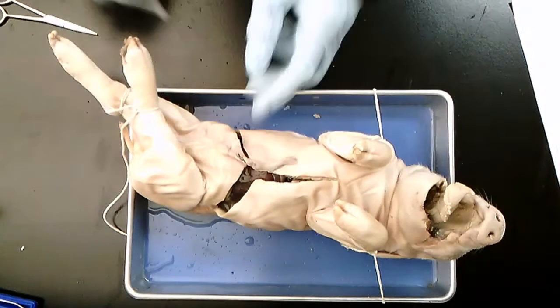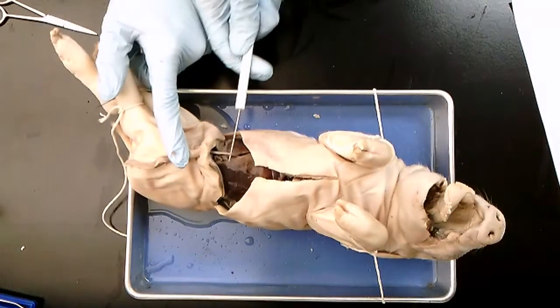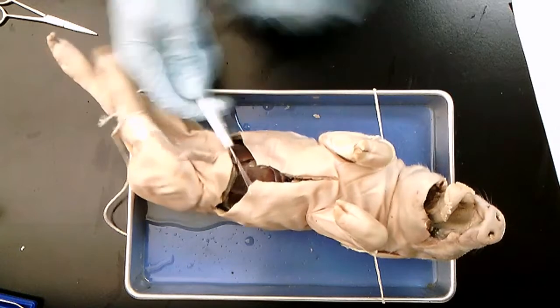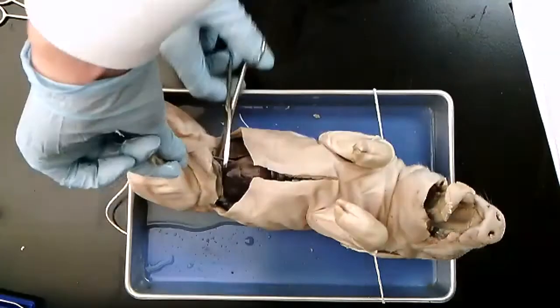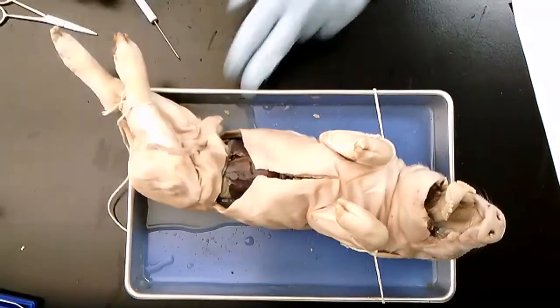So I'm going to point something out. If you can see this vein right here that I'm kind of holding up, that's the umbilical vein. Once your students identify that, it's okay if they take their scissors and cut it. That way, they can start to fold skin back.